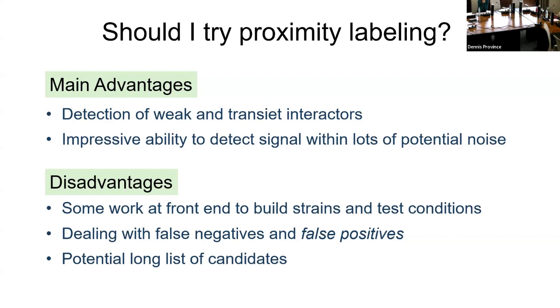It's not like nice, soft, squishy cells, where you just do something with a weak detergent and at least some of those direct physical interactions survive. So, it's great for weak stuff because it's all happening in vivo. You don't have to preserve that interaction. It's really impressive in my experience to detect signal within a lot of potential noise.